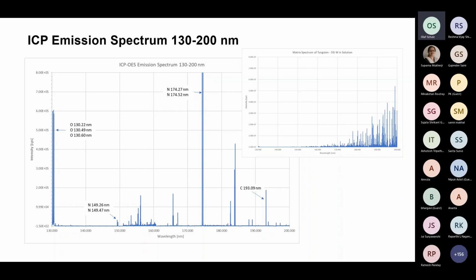Well, the spectra you see here on this slide, the comparison of a water with a tungsten matrix, probably provides the answer. Unlike other spectral regions, the VUV range is rather clear from emission lines from transition elements. So emission lines present are likely free from interference, and in addition, some elements have their only sensitive emission line in this wavelength region.